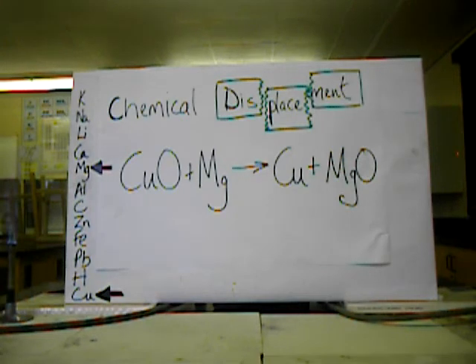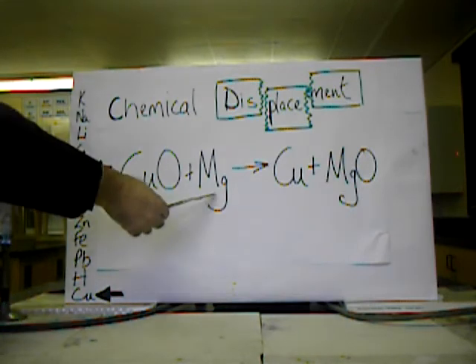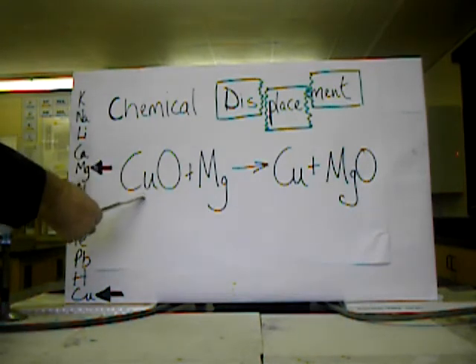Let's take a look at an example of a displacement reaction. This is quite a spectacular displacement reaction. Here we have a reaction between magnesium metal and copper oxide.